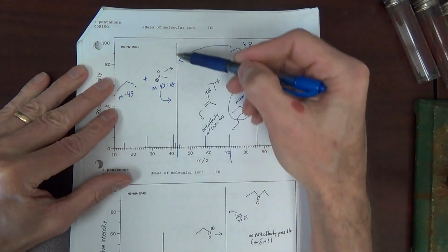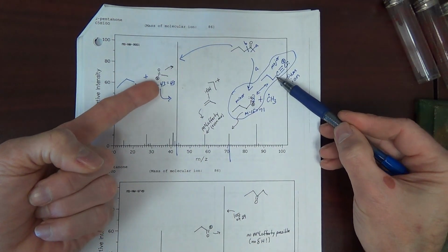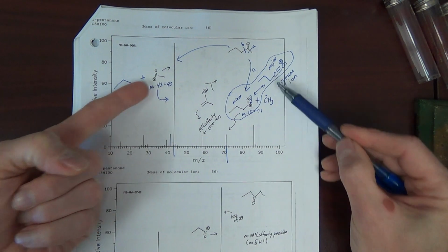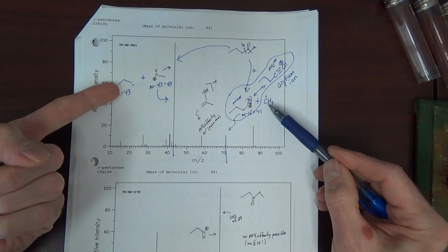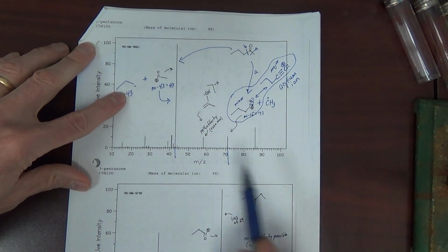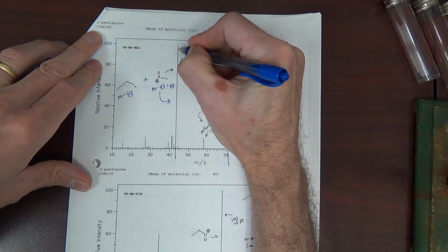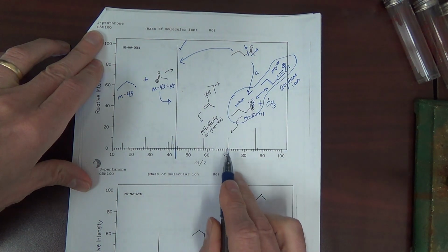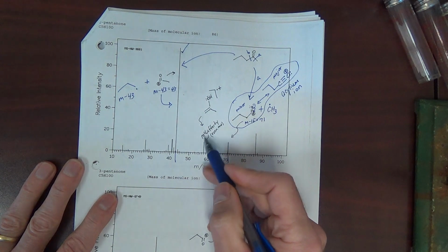Why was this such a more predominant cleavage pathway? Both of them are resonance stabilized acylium ions. But let's look at the radicals. Which radical is better? Primary radical or methyl radical? Primary radical is better. Thus, the system favored coming here, and that's an argument for why the base peak is at 43 and not at 71. Okay, McLafferty.